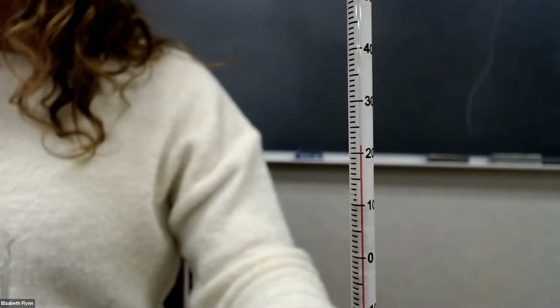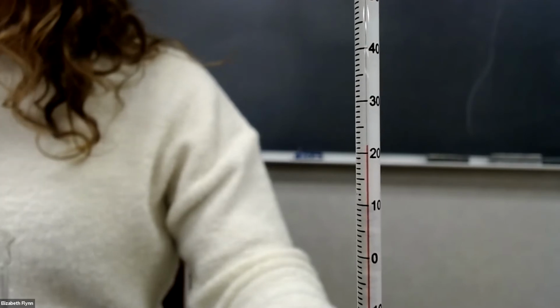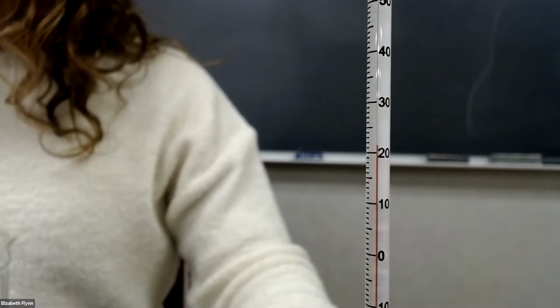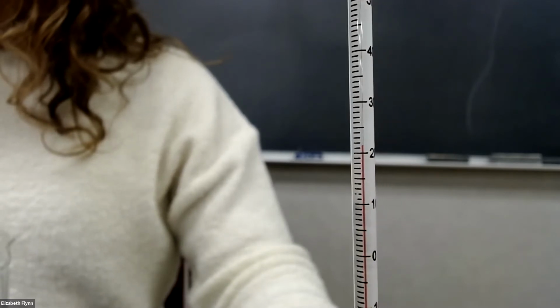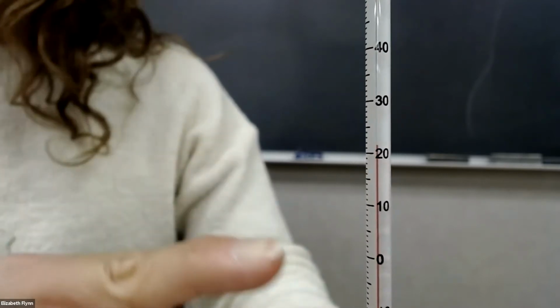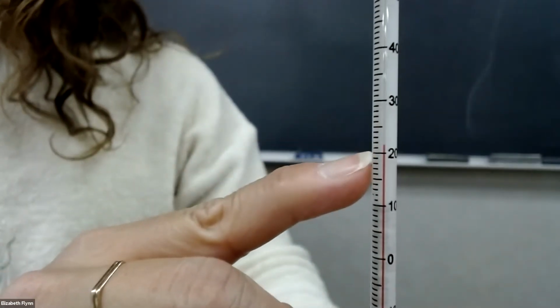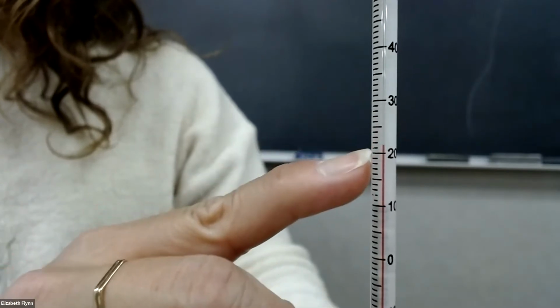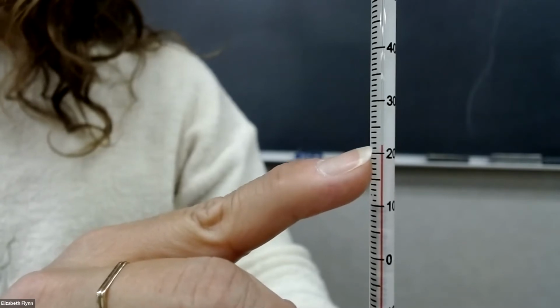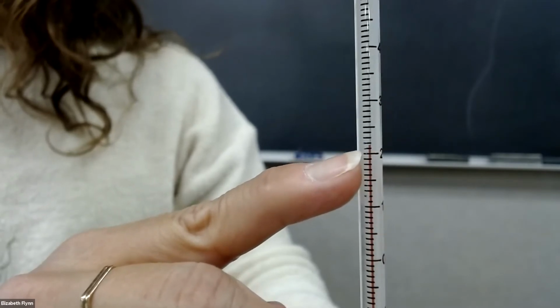Alrighty, now we're measuring the temperature of the water. I've got my thermometer here. So what do we say? How many degrees Celsius am I measuring here for the water? Right? We know it's at least 20, and here's 30 up here. So each of these little marks is worth 1 degree Celsius, right? So we know it's for sure 20, for sure 21, right? Now we have to estimate between the 21 and the 22. So what does that look like to you?